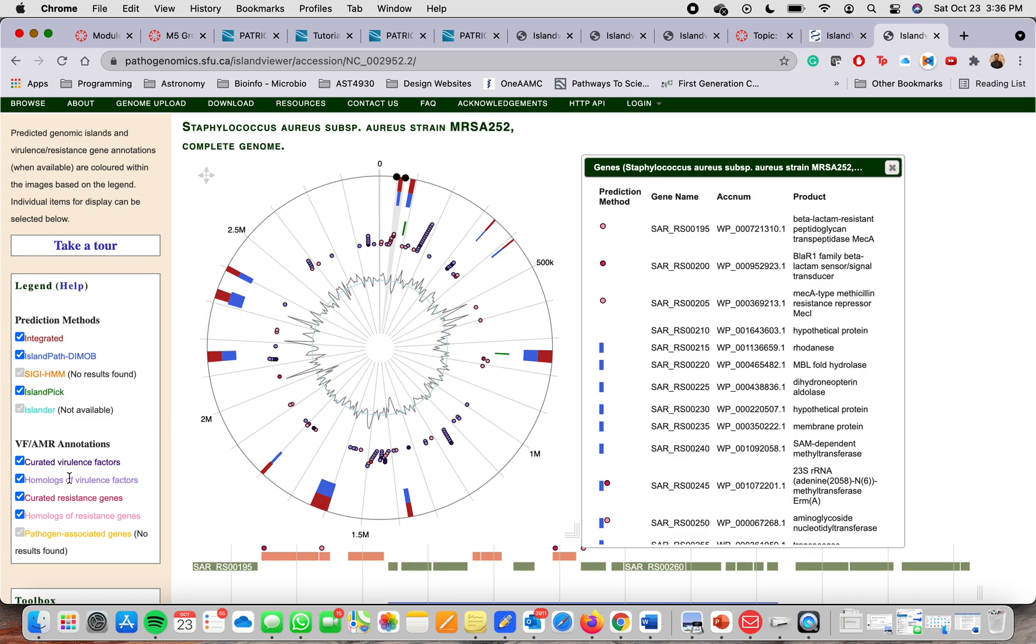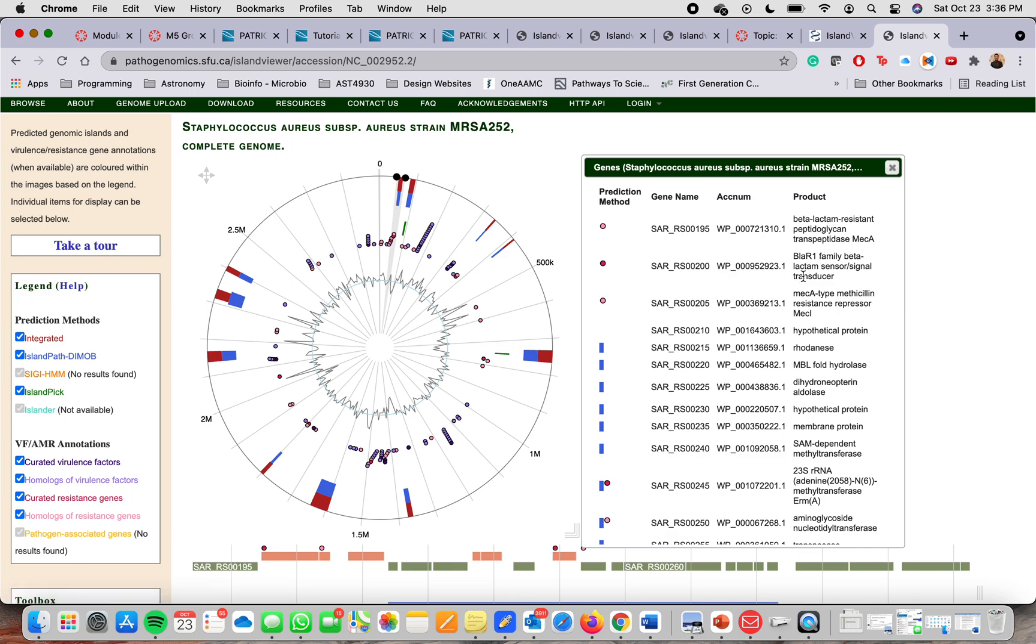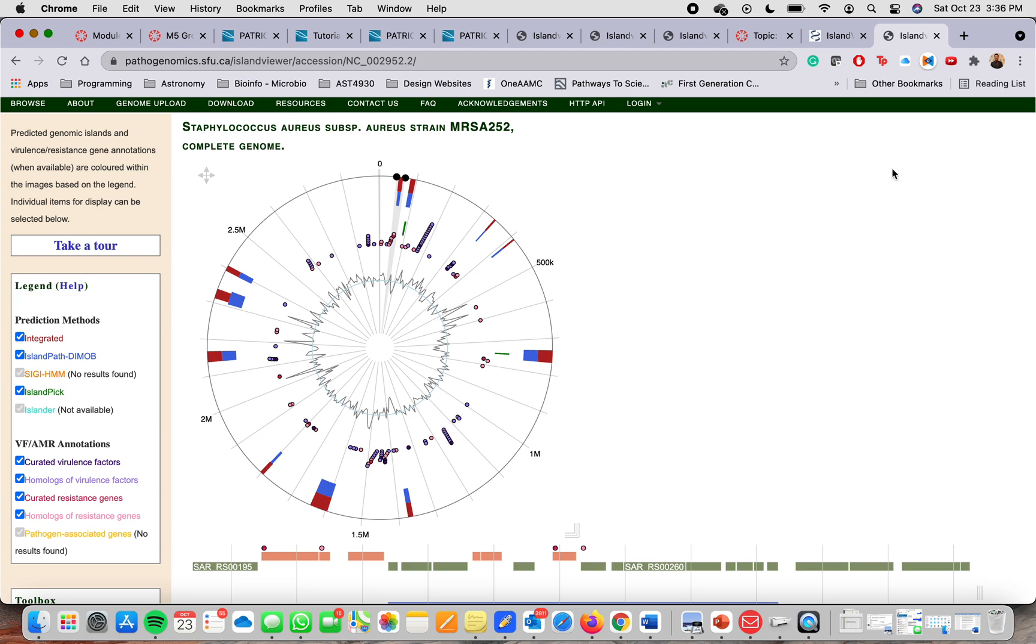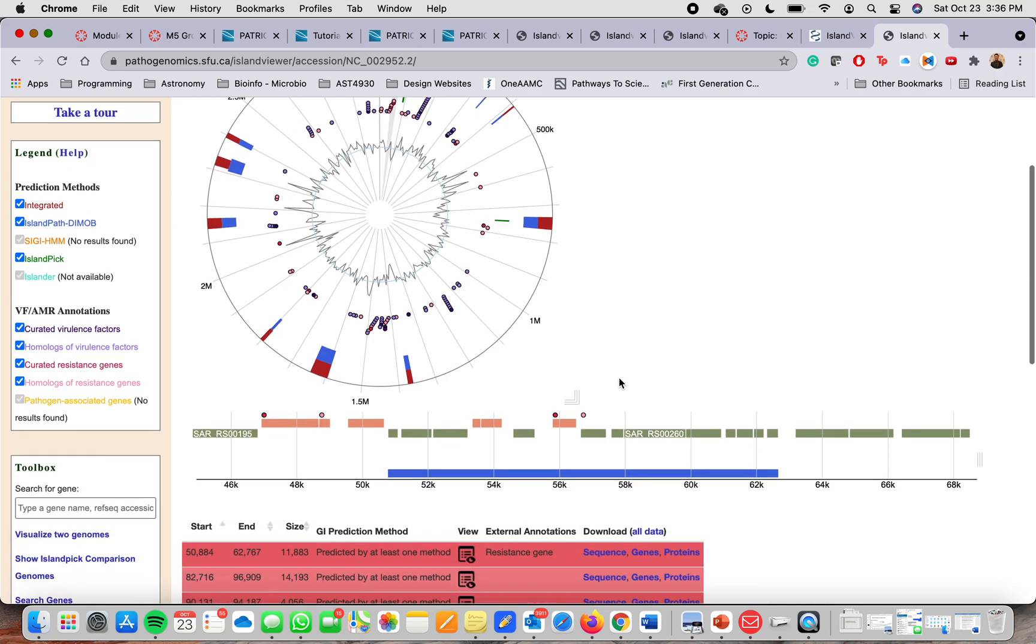As you can see here, this pink color tells you that is a homologous of resistant genes. You also have curated resistant genes and it'll give you the gene name. It'll give you the accession number. It'll also tell you about the product of the gene.